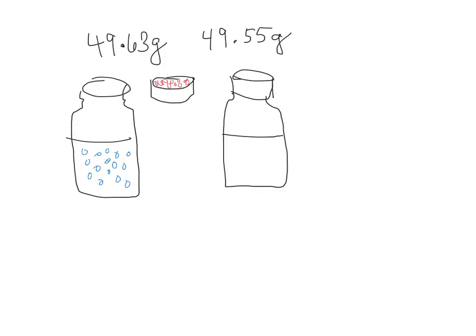All right, so how are you going to explain that your mass went down from here, the before, to here, the after? I believe we had some discussion on that already. One group in one of the classes actually spilled water out of the vial. Terrible. You should be ashamed of yourself. Some people mentioned that they spilled sugar when pouring the sugar into the vial, that not all of the sugar made it into the vial.